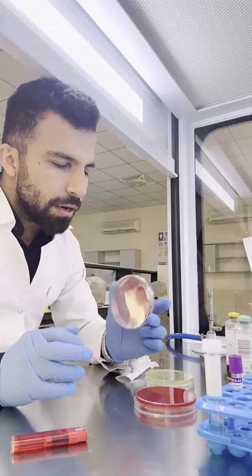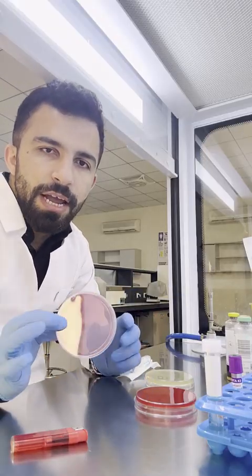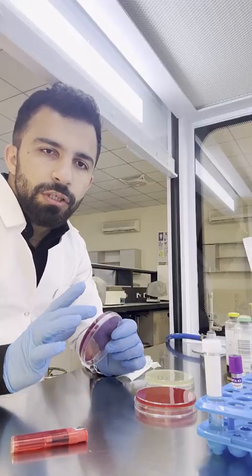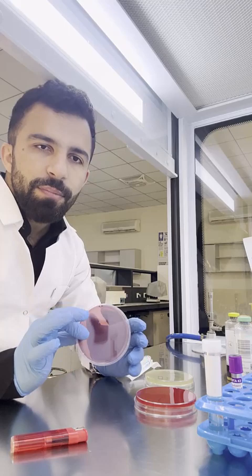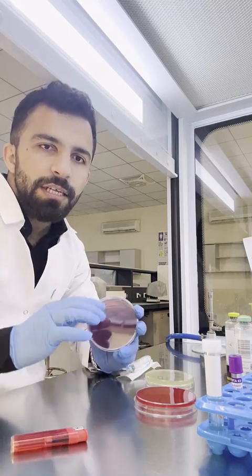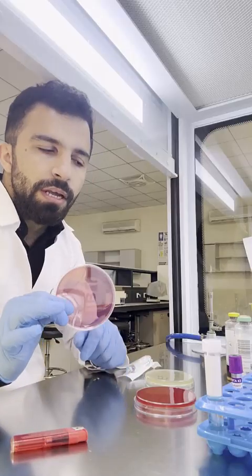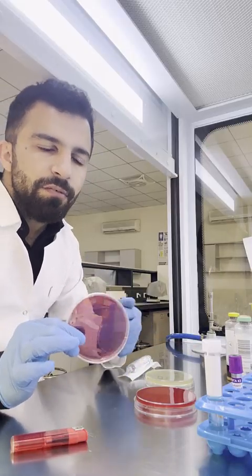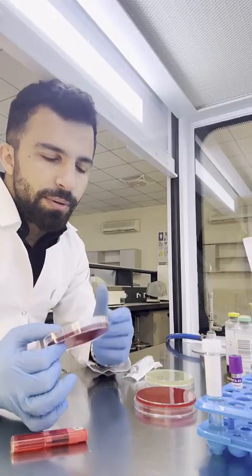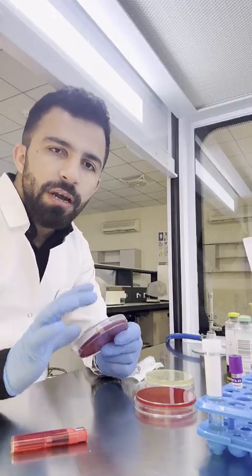We have the MacConkey agar, which is a selective and differential medium which allows only gram-negative bacteria to grow and inhibits the gram-positive. That is why it's selective. It only allows gram-negative bacteria to grow. And it is also differential. What do we mean by differential? It separates fermenters and non-fermenters.